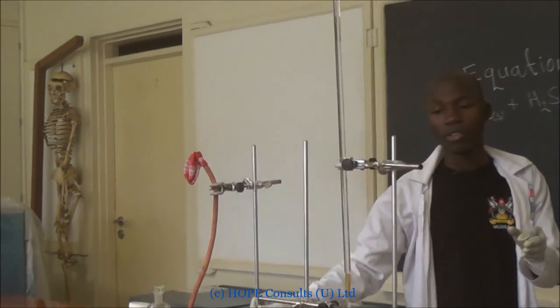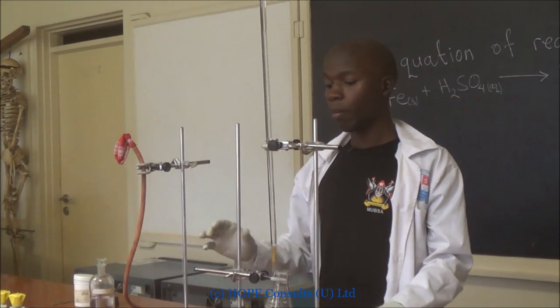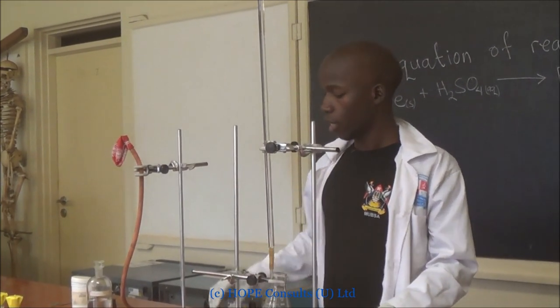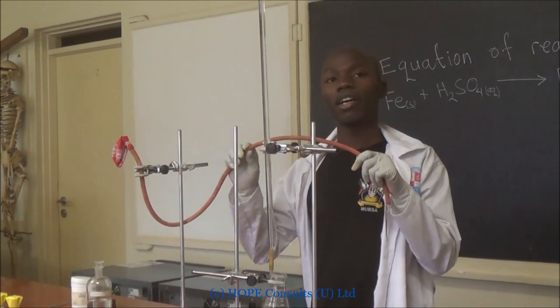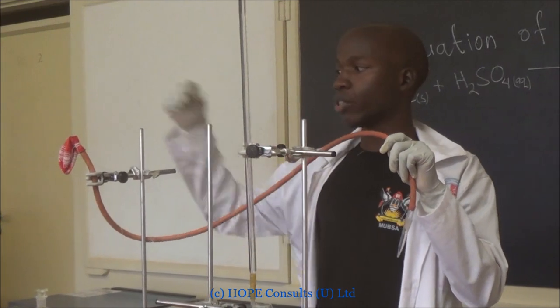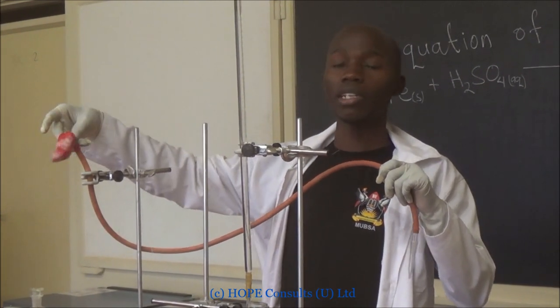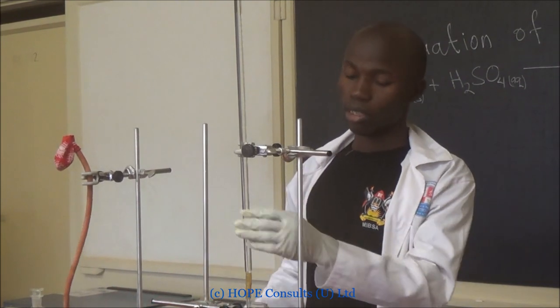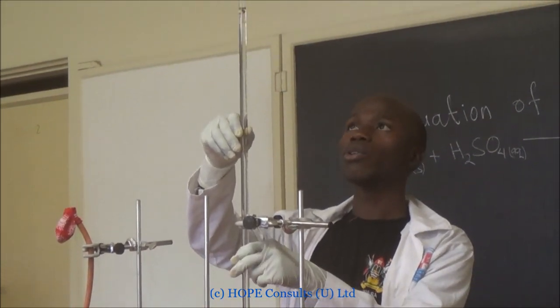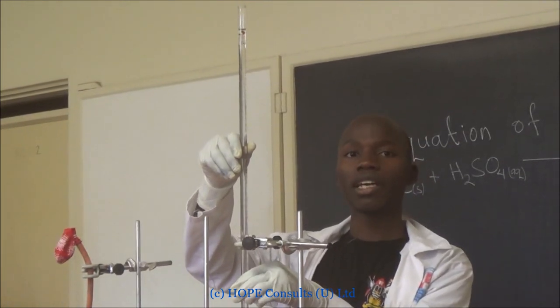We have these little stands. They will hold the apparatus in position. And this is a rubber tube that we use to deliver the gas to this balloon where the gas will be collected. This is a burette. I will use it to hold the sulfuric acid.